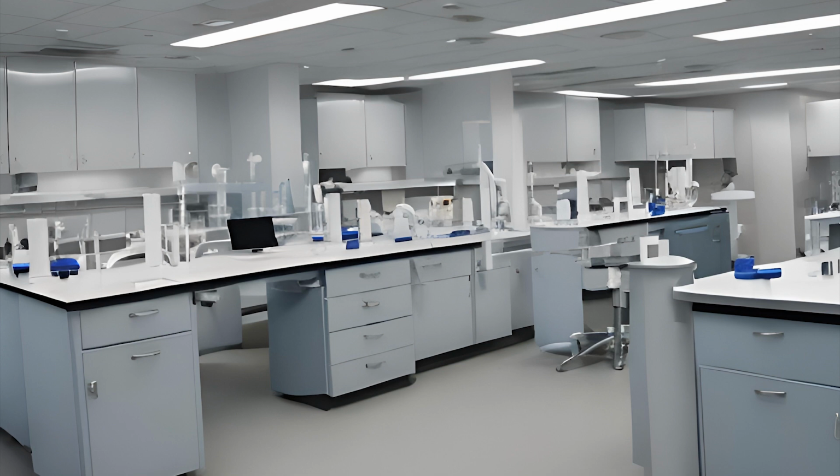You don't want to spin your serum samples down until they're completely clotted. Usually that'll take 30 to 60 minutes at room temperature. You can tell visibly if your sample's completely clotted because when it is, you'll see some of the cells separate from the plasma and serum. There'll be a thin serum or plasma layer on top of that clot, and you invert it, and it'll literally fall from one side of the tube to the other, like a big lump or chunk of cells. When you see that visible clot in the tube, it's ready to spin down.